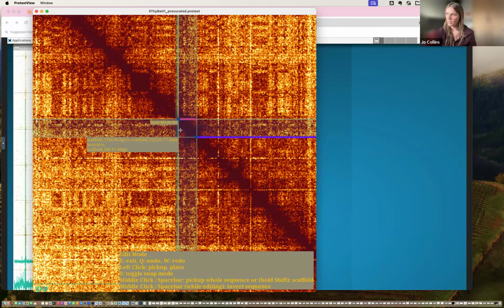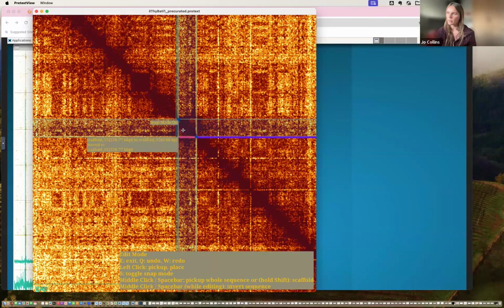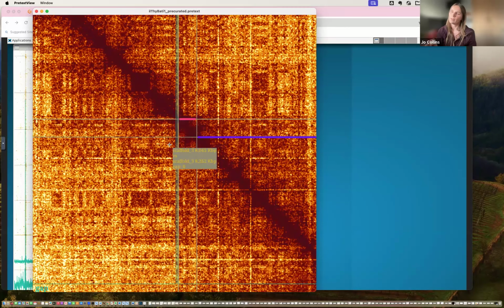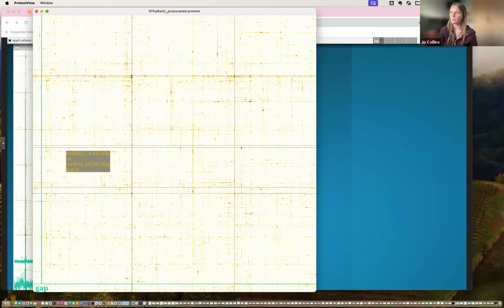If we were to invert this, I'll just show you what it looks like. You can see that it looks wrong, the signal's off. Sometimes it's a bit unsure, but if you have a play with the scaffold, you'll usually find that one way up is definitely preferable to the other. So in that case, we've put that small piece in.